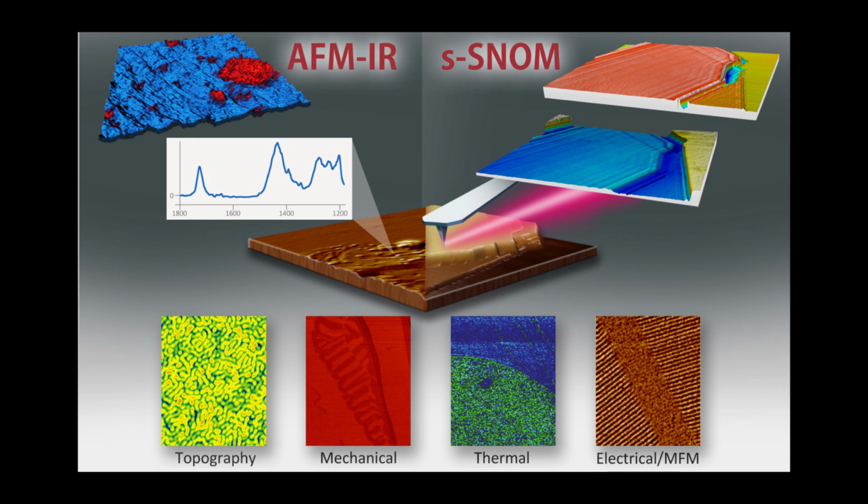A fortunate thing in relation to this is that there's an alternate technology called TERS, which gives you high spatial resolution Raman spectroscopy. Within the TERS technique, it's more challenging to get the Raman enhancement off of the tip. Also, in order to get the Raman enhancement, it's typically a short-lived phenomenon in which the tip needs to be very freshly prepared.